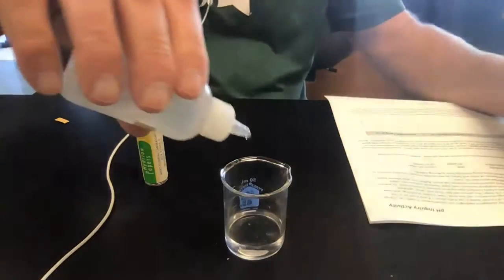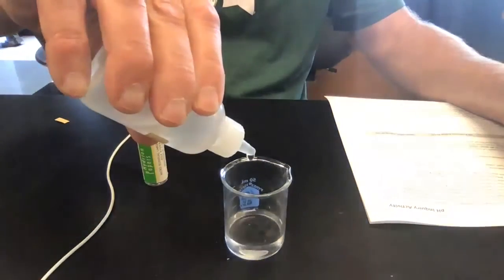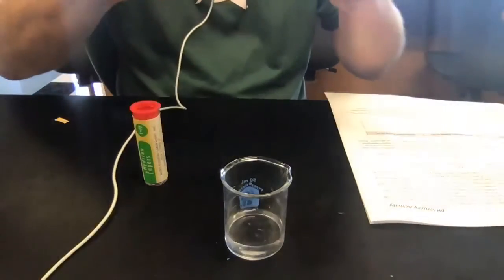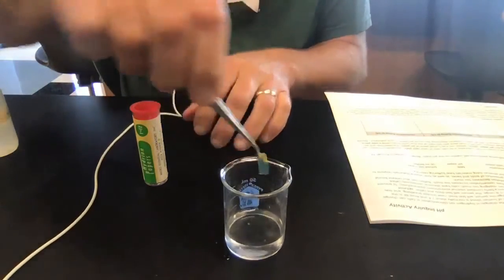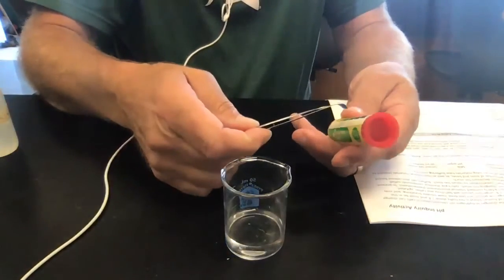I'm going to add the first 10 drops of the base. 2, 3, 4, 5, 6, 7, 8, 9, 10. Put that in, and I'm getting pretty blue all of a sudden, really quickly.